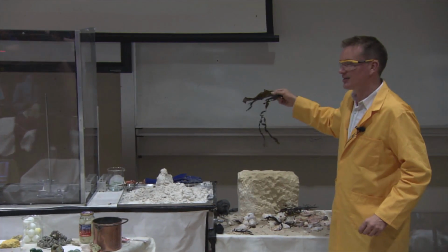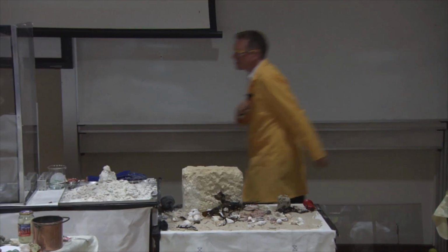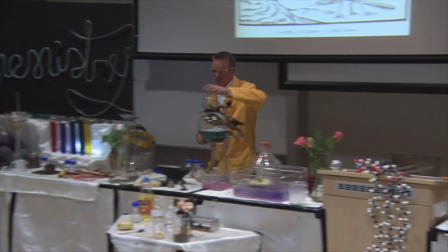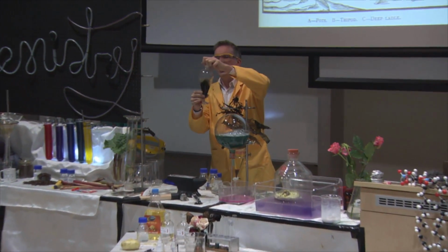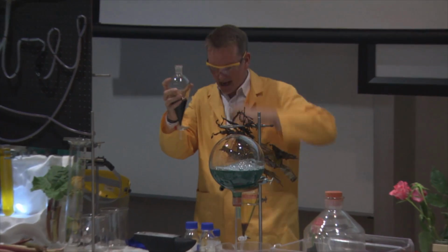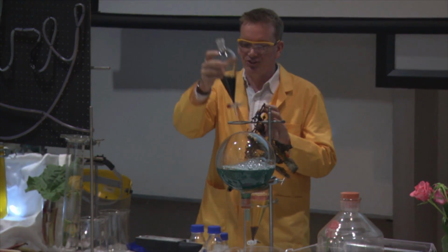But there's another element that was first discovered from ash, not wood ash, but ash from this stuff, from seaweed. Okay? Now we thought we'd try this. So we took some seaweed and we completely burnt it into ash, and then we added some water, got a thick sludge, and then we filtered it. So now we've got this brown solution. And so this is our gooey seaweed ash with some water.